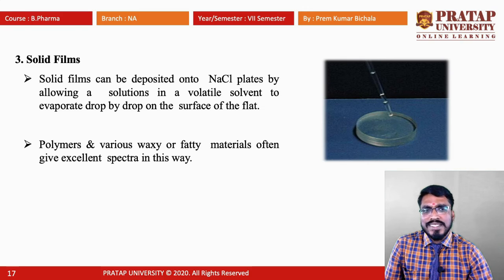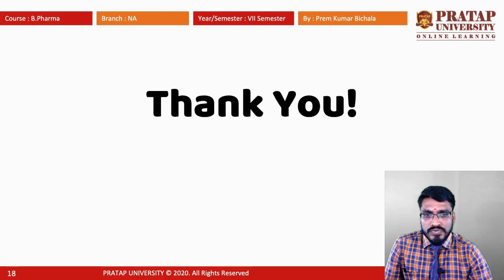So based upon the sample nature, we choose the different techniques. If it is solid, we use the mull technique, KBr disc technique, or solid films based upon the nature of the sample. So this is for today's class. In the next class, we are going to discuss the instrumentation part 2, in which we discuss detectors and recorders and interpretation of the IR spectrum. Thank you.